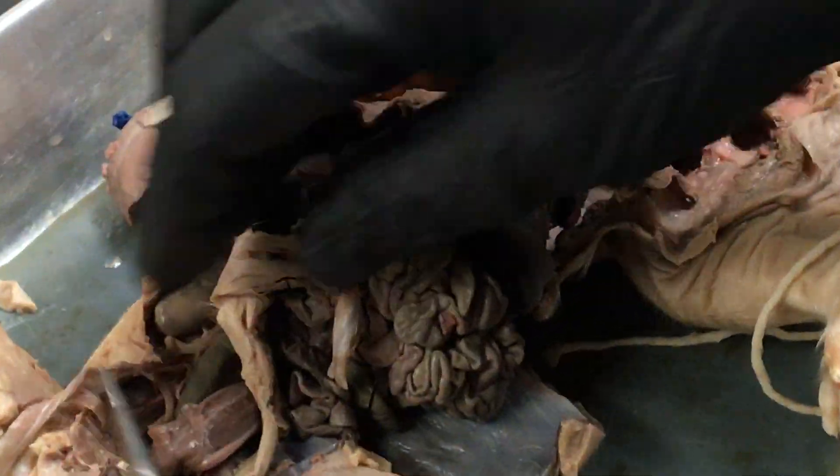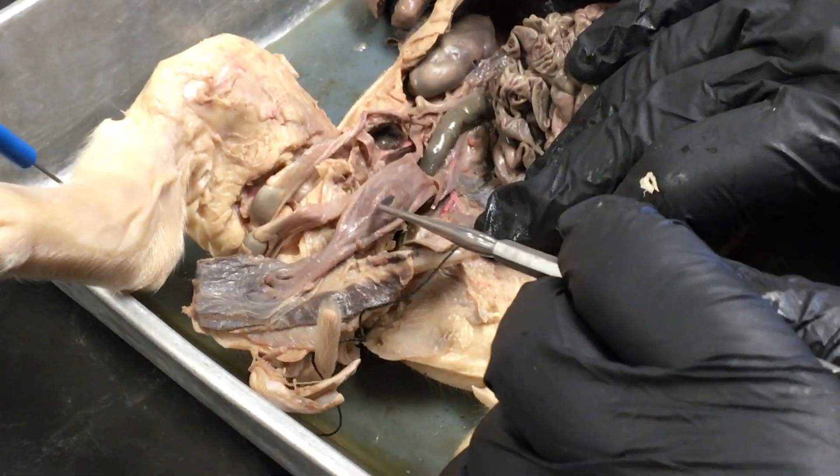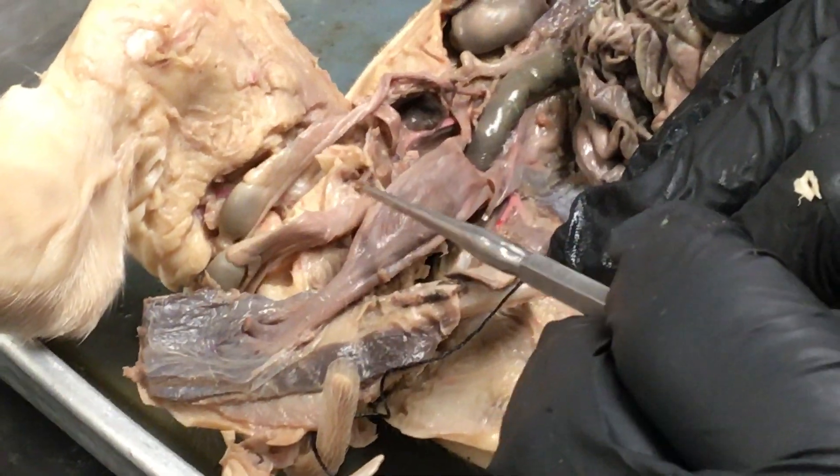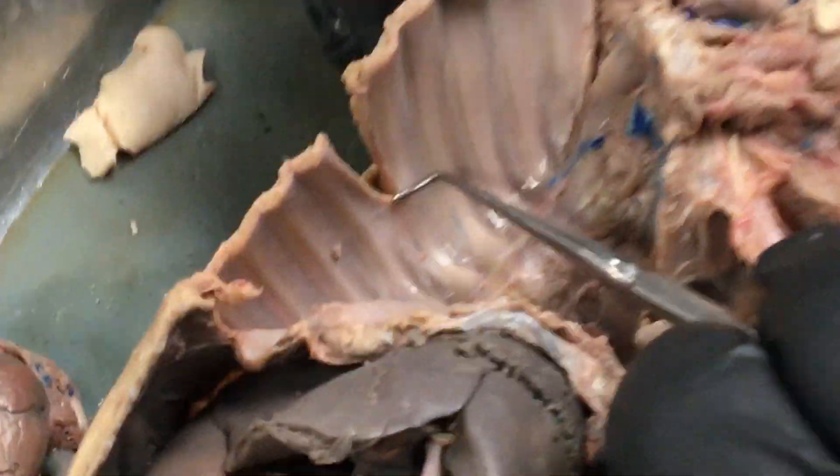Again that's our umbilical vein, attached to our umbilical cord. If you flip it down you find the urinary bladder right here, and then we have umbilical arteries right there. The arteries between the ribs are called intercostal arteries — we can see a good example of one right here, a little red line.